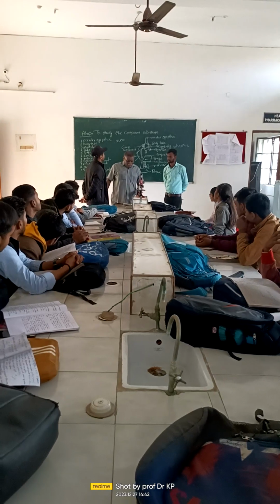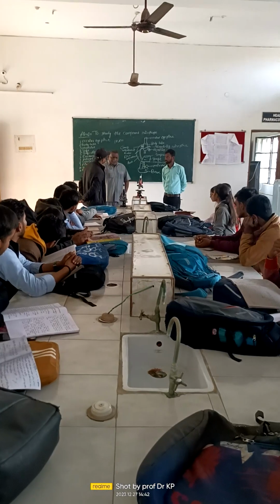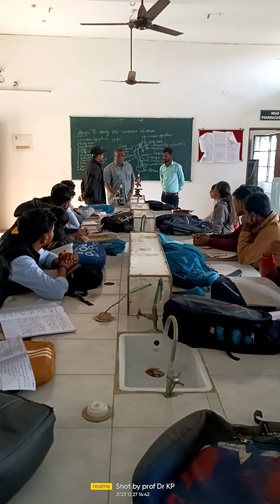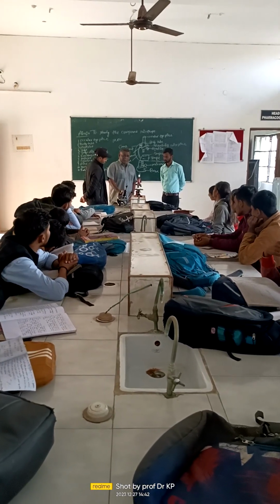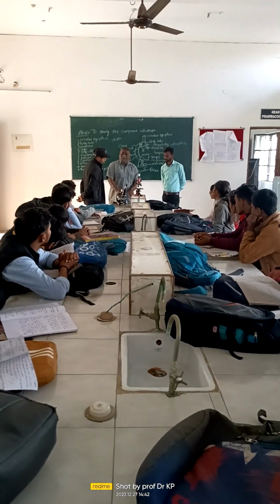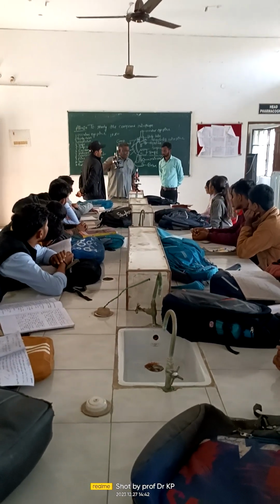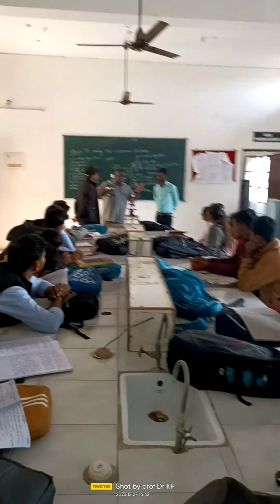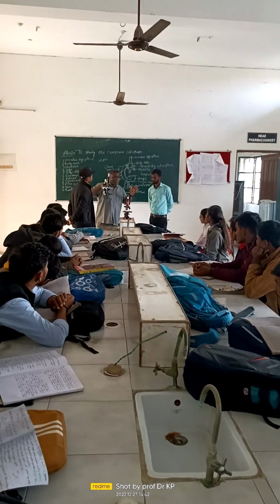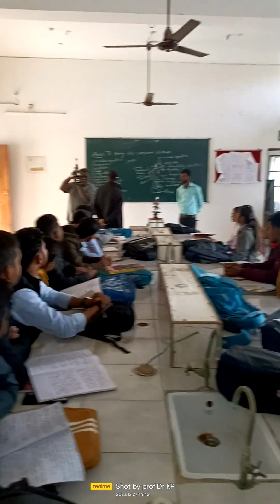Focusing or using a microscope always has a procedure. You must lift the microscope always with your right hand and should not tilt it like this. Sometimes the slides are not held very well with the clip, and it will fall off. You understand? So always you must hold the microscope like this. Everybody may not have enough strength to lift the microscope, but it weighs more than half to 1 kg. So you can put the hand under the base. This is the way a student should hold the microscope.